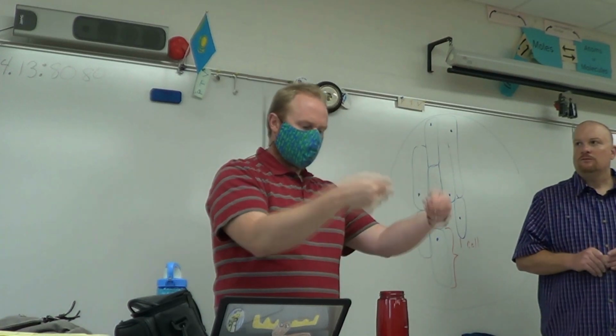And when we're all done, we'll rinse off both the slides and cover slip, and there's just some paper towel laid out. All you need to do is just set your slide and cover slip wet, perfectly fine on those, and you can walk away, and we'll call that good for cleanup today.